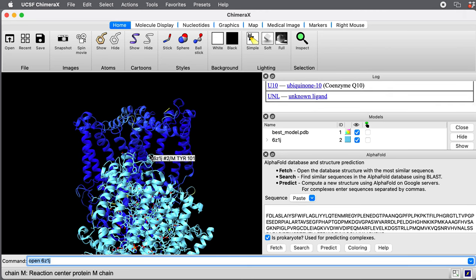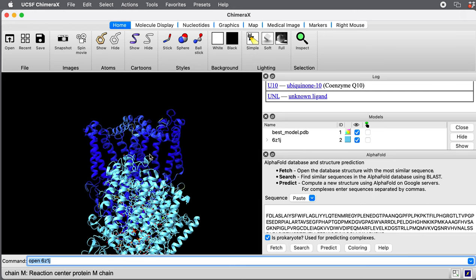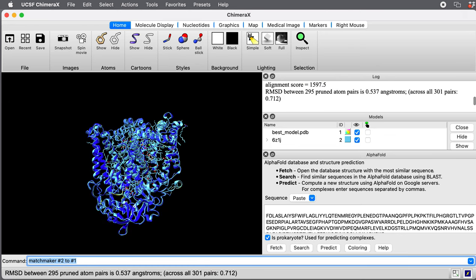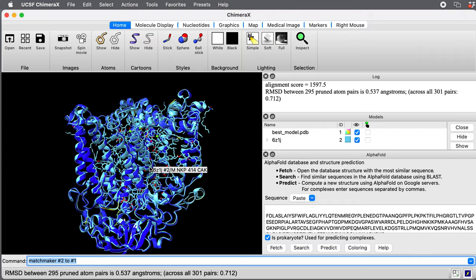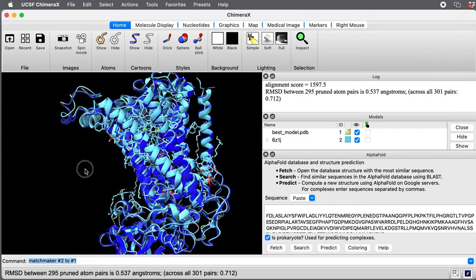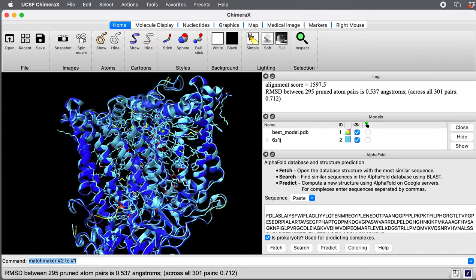It's not aligned. I'm going to align it. I'll do that with a command, matchmaker number two to number one. Align the experimental structure to the AlphaFold structure. There we go. You can see things look pretty good.